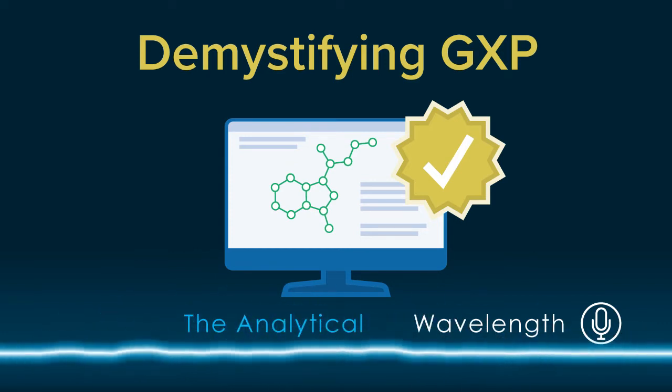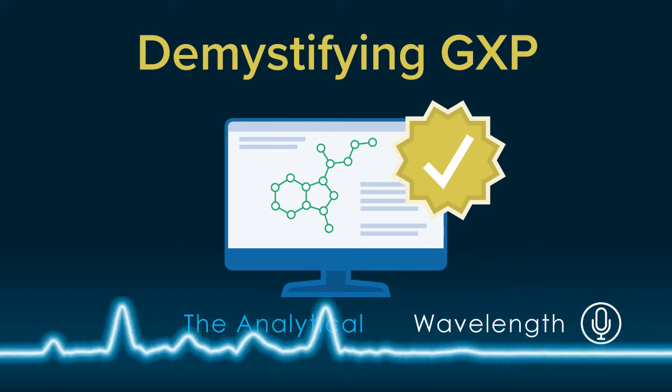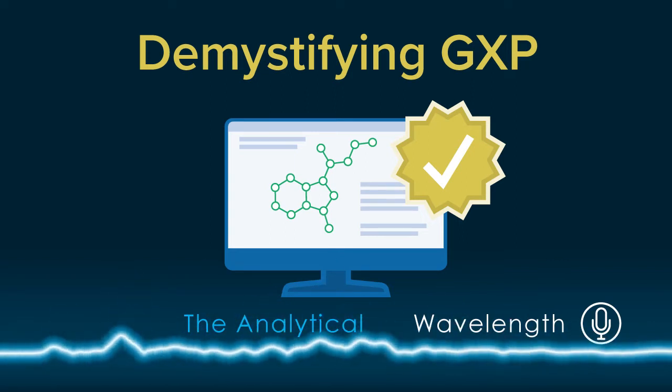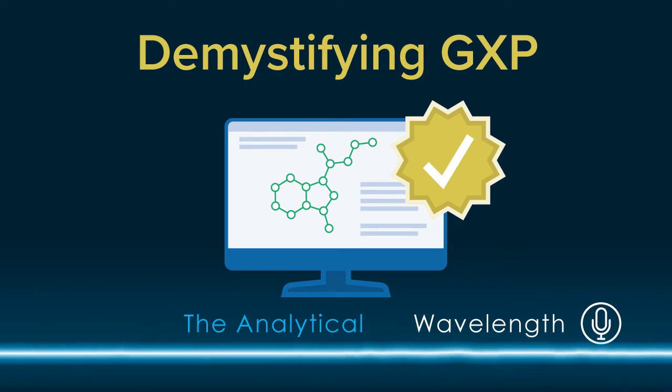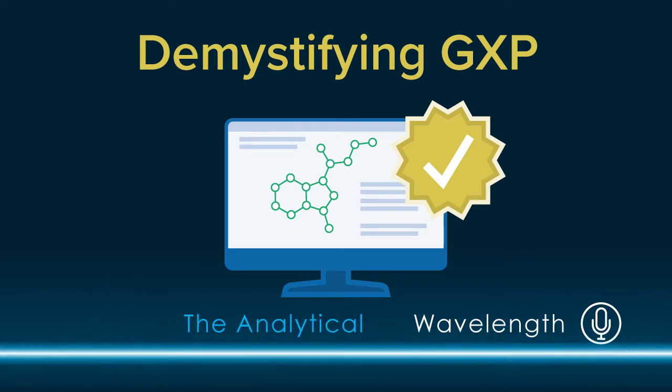This software system must have specific user accounts. So you can't share one account across several people. The software has to have forward compatibility of all the files that are generated within the software. So next year, if a vendor comes up with a new version of the software, it must be able to read files that were generated from the previous versions. And all records, including the audit trail, must be protected from tampering.